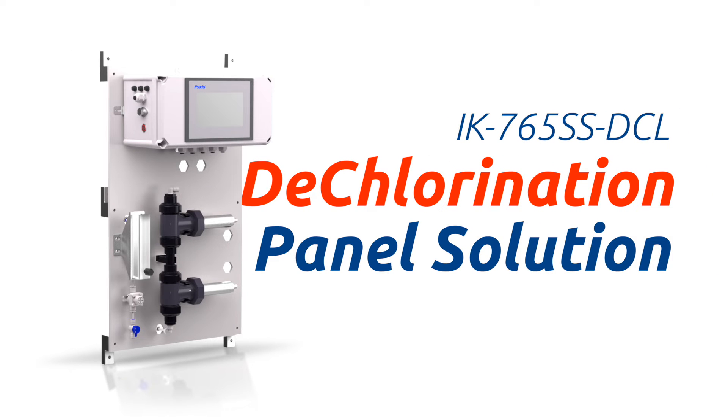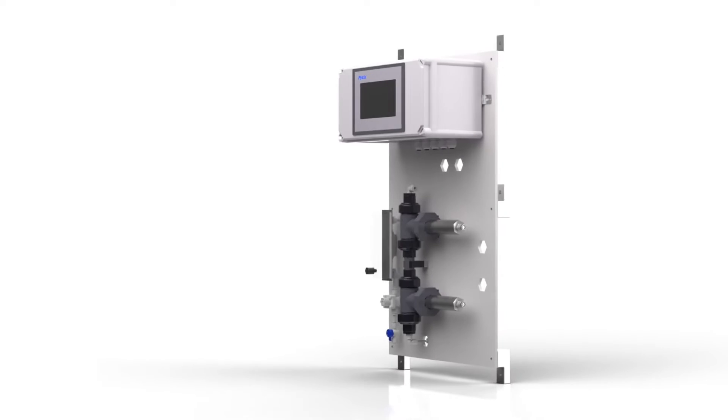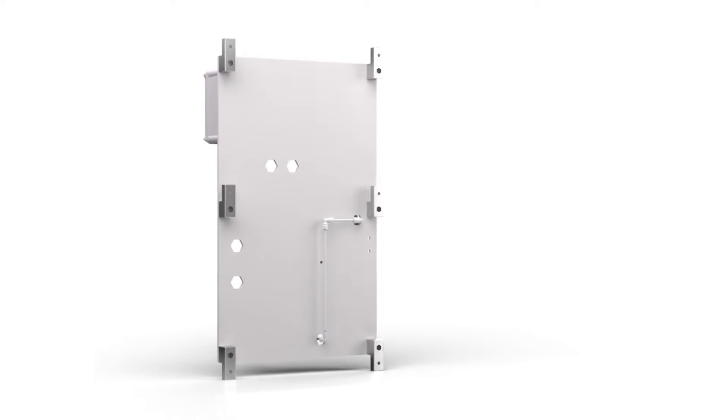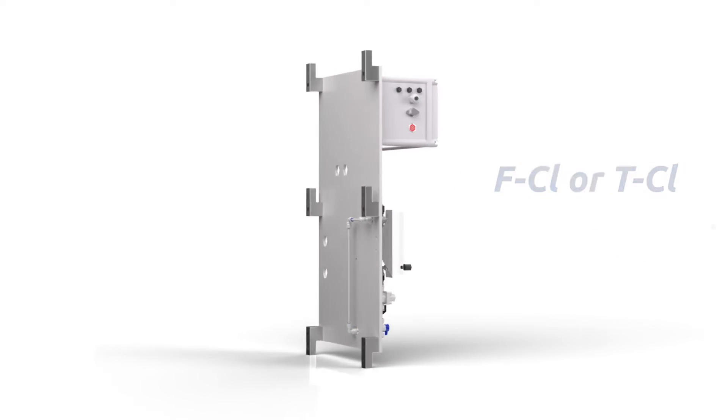Pyxis Lab is pleased to introduce the IK765 DCL Dechlorination Analyzer panel for reverse osmosis asset protection. This unique analyzer offers the world's only three-in-one reagent-free measurement capability for the detection of ultra-low residuals of free or total chlorine, sulfite, and pH.